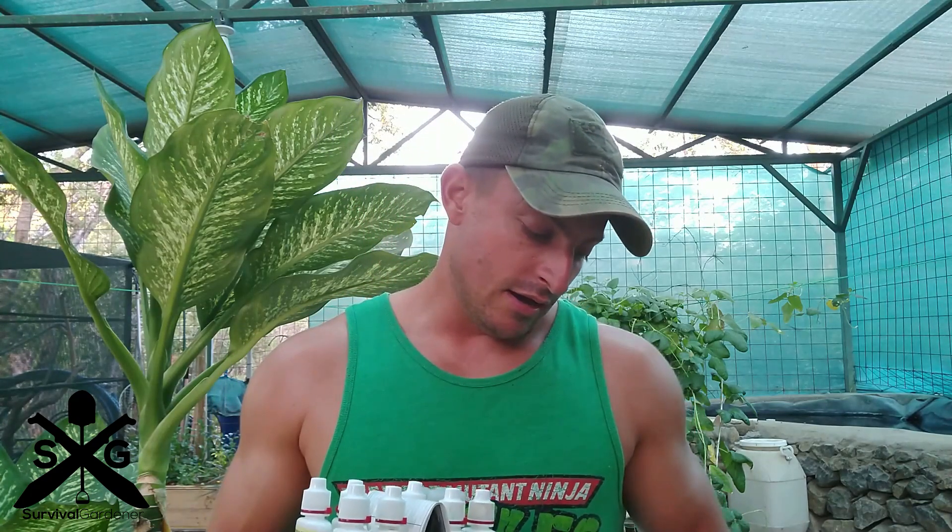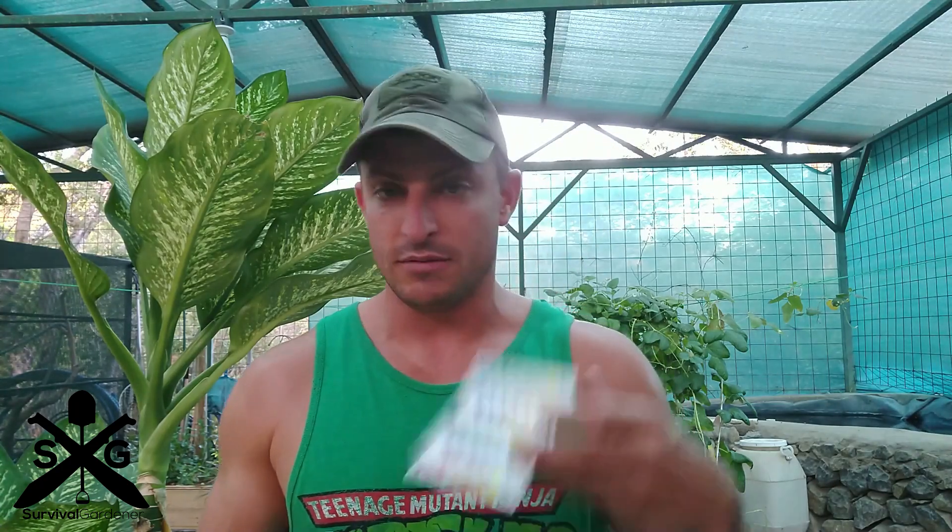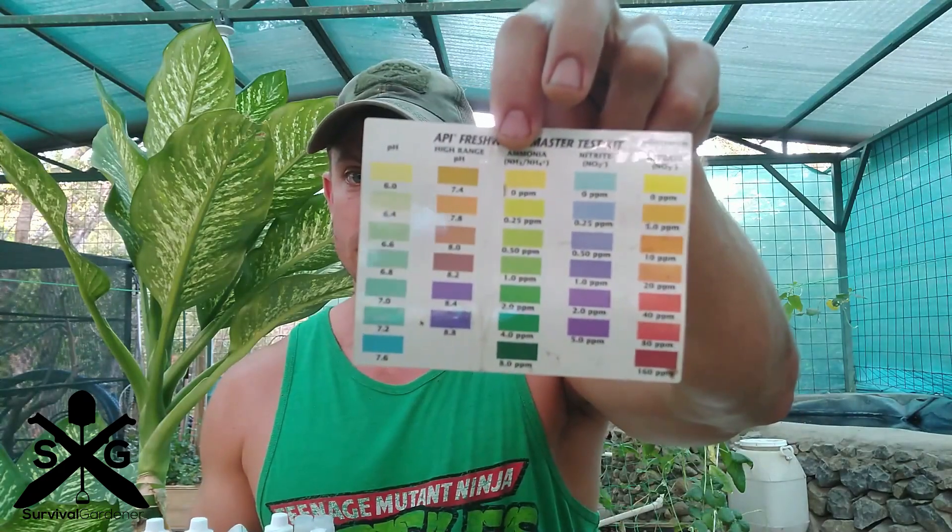If you have too high nitrites, for example — it's a super quick test — it can be toxic for your fish and your plants. There's a lot of cool things you can read into this test. It's pretty simple: you follow the instructions, take your test tubes out with your liquid in it, and match them up to the colors on this chart.